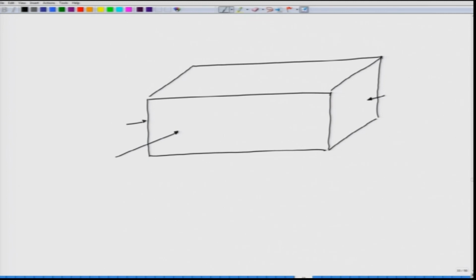There are two ways, either you will see an extension on the back of it, or it could be horizontal or it could be vertical. On the top of it you will see a kind of enclosed structure.